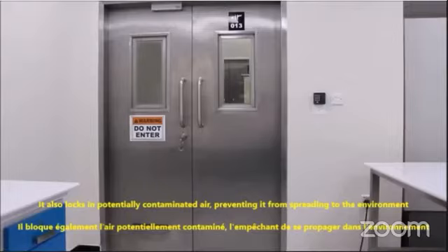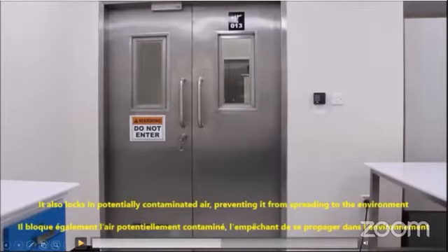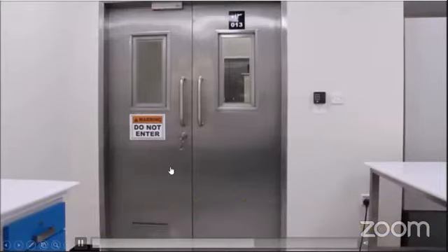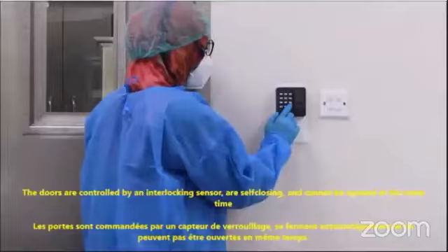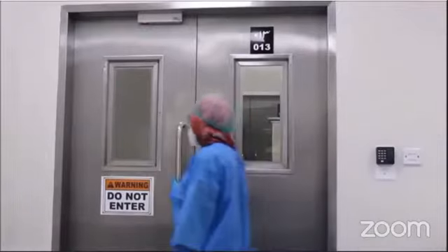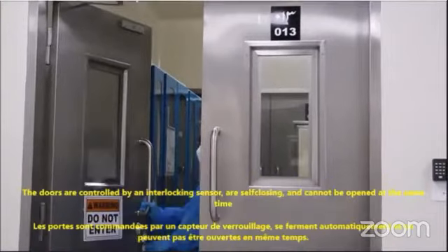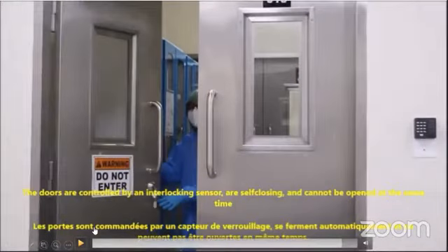The interlock system includes the outer door that opens into the anteroom and then into the BSL-3 facility. The doors are controlled by an interlocking system, sensors, and the pin code. These doors are self-closing and cannot be opened at the same time.